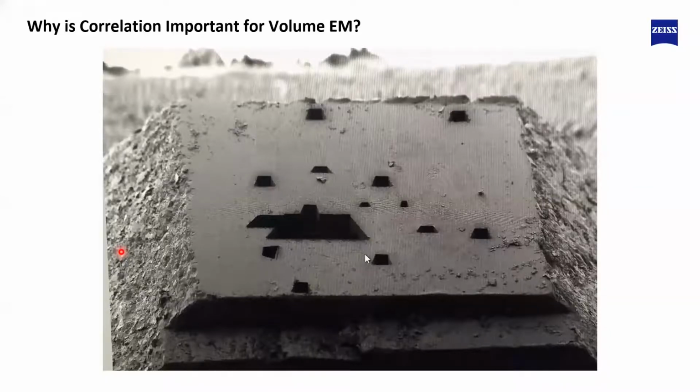What I want you to be aware of is that there are a lot of examples that end up with a sample like the one we see here on the screen, where we approached the sample with focused ion beam SEM and trenched into various regions, not really knowing where our volume of interest is. I can tell you this is around a week's worth of work. And you don't want to be the operator walking away, not being able to demonstrate that you actually found your target of interest, and probably even have to abandon the sample because you just don't know where you are.